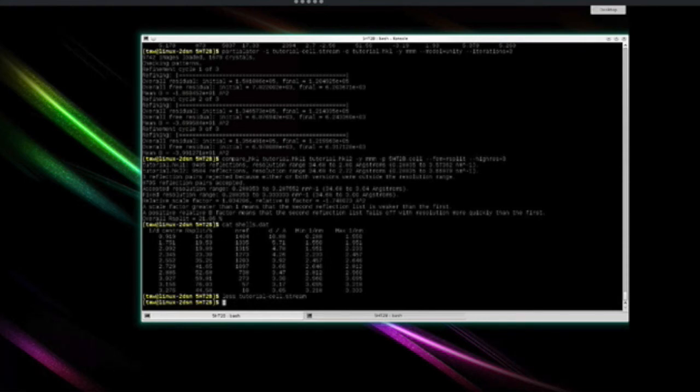For shared geometry files, at least for LCLS, they've now created a page on the Confluence. If you search the Confluence, you'll find that. The idea is that after every experiment, people publish their refined geometry file so that everything is shared. Eventually, the hope is that LCLS themselves will provide those geometries. The thing that normally causes the problems is the locations.